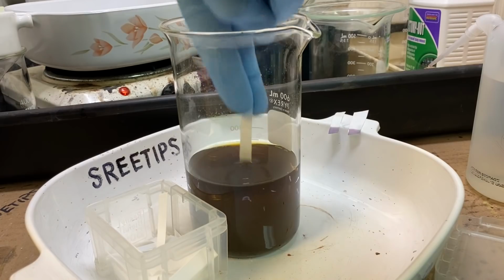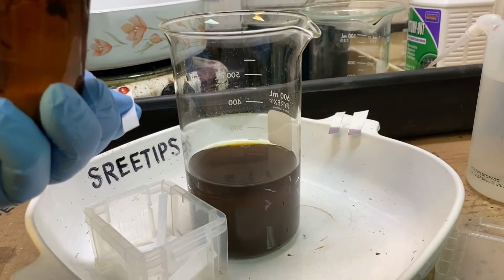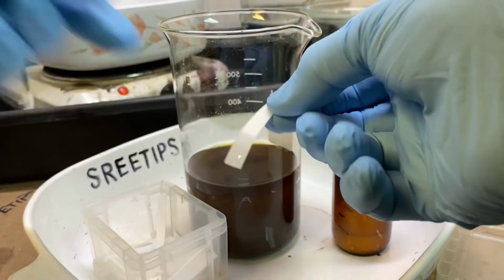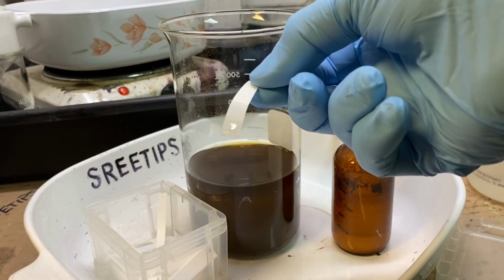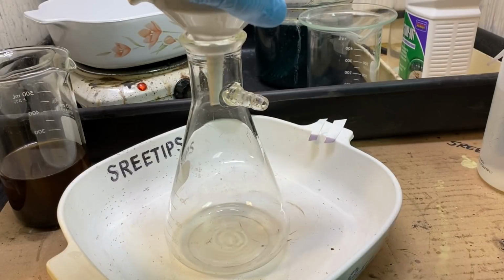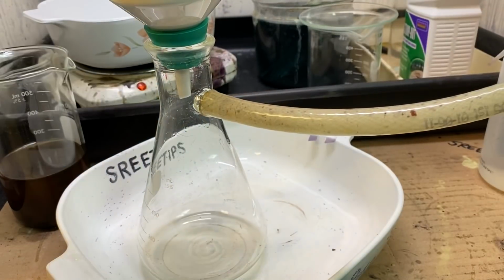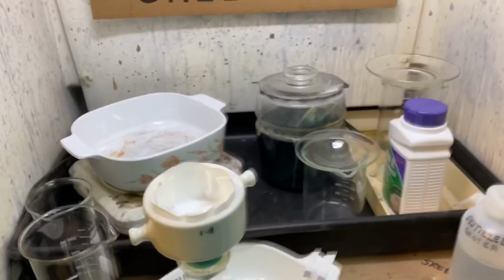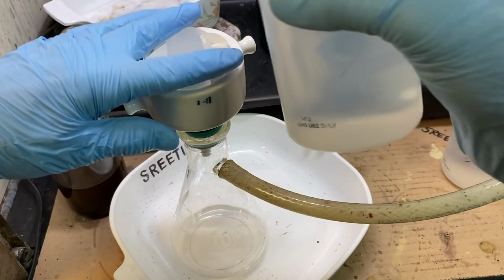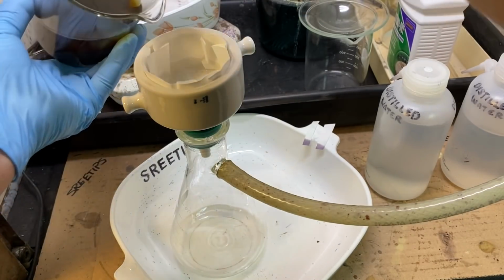Now we're going to stick some filter paper in here, get a little bit of solution on the end of here. Test it with stannous, make sure we got all of the gold out of solution. As you can see by that stannous test, there's no precious metals in solution. And capture our pure gold powder in the filter. So we're filtering out the good gold metal here, capturing it in the filter paper. The solution will be a waste solution. Here we go.